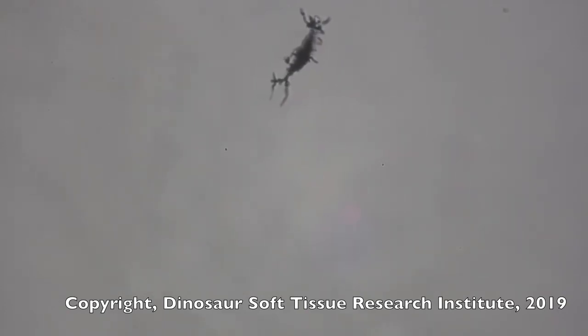So these are soft tissues. These filipodia are soft. See that wiggling? That is a soft osteocyte, or bone cell, from a nanotyrannus vertebra.